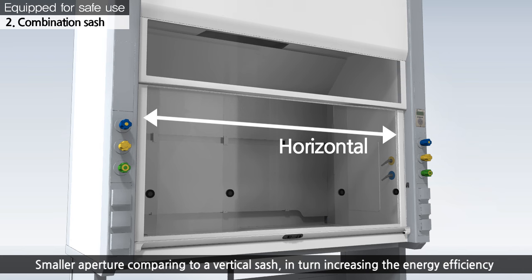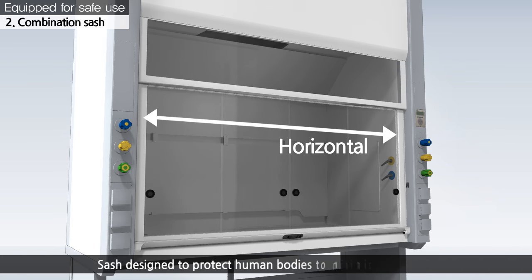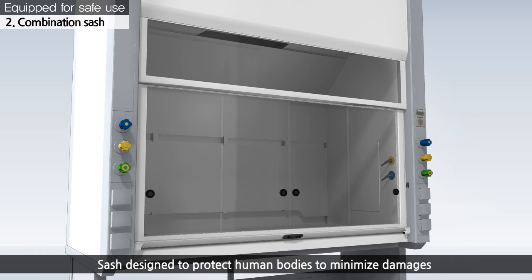In addition, it is possible to operate using only the arms. In doing this, researchers can control laboratory work more safely.